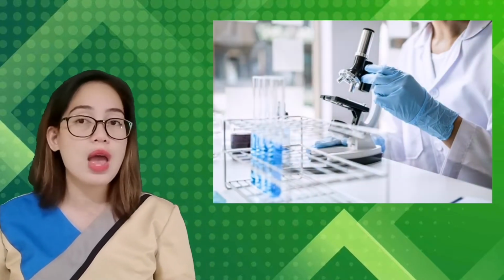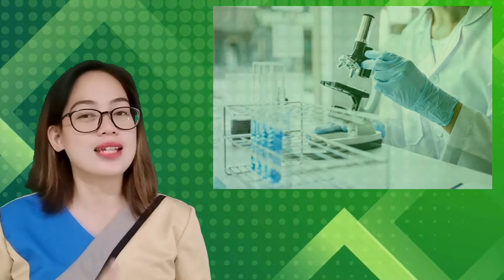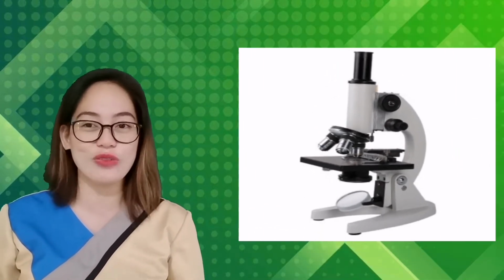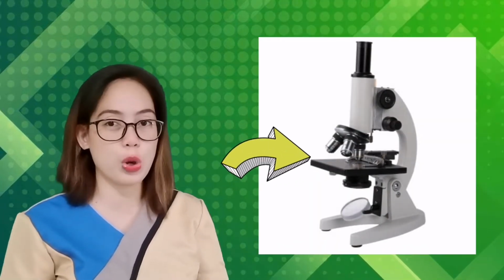It is very important to know the parts and functions of the microscope so that you will be able to identify the structure of the things you want to view and determine exactly that structure. At the same time, we can easily use the microscope because we already know its parts and functions. In our school, the only available microscope is the compound microscope.